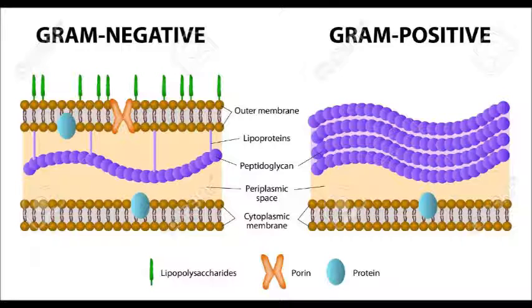I'm going to be explaining the difference between gram-positive and gram-negative bacteria, and I also am going to go over the process of gram-staining bacteria. So let's get this thing started.